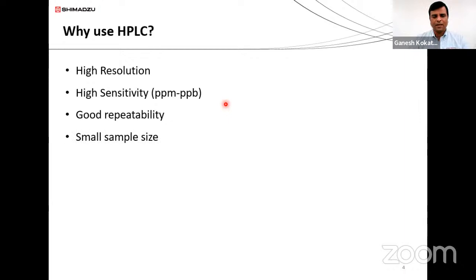Small sample size. For the analysis, we require hardly any sample, in ppm, in the milligram range, not a gram or like that. So the sample size is very small.